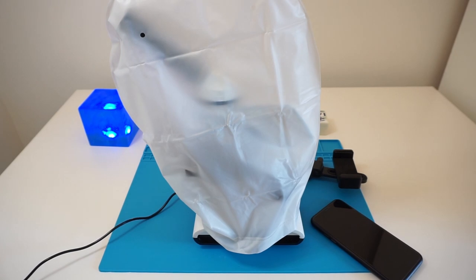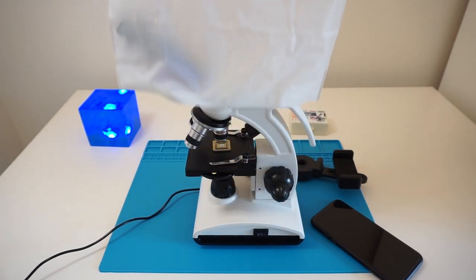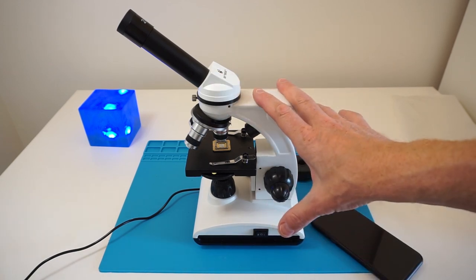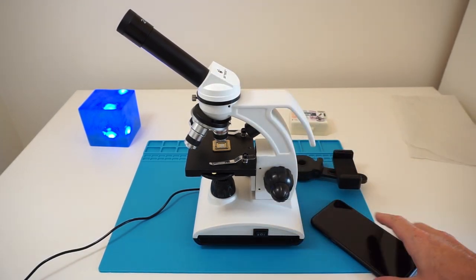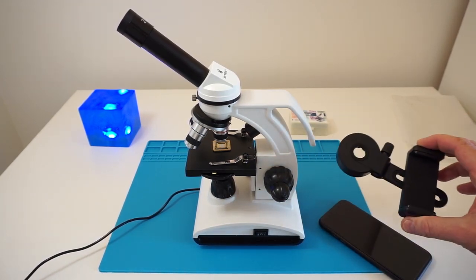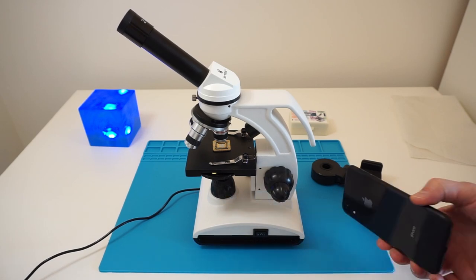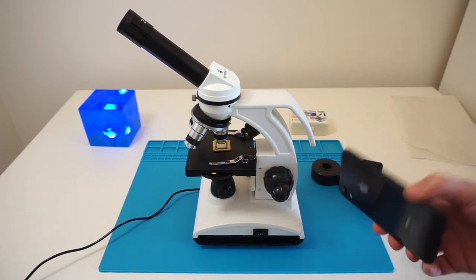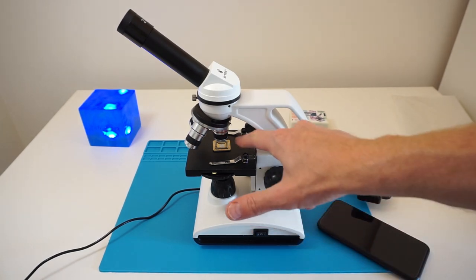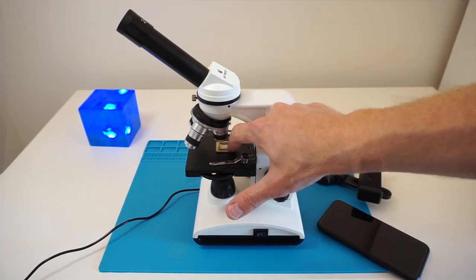Now that we have set up the microscope and played around a little bit, I would like to demonstrate you how it works. And maybe we can start by looking at the microscope. Later on we will see how we can attach this adapter to an iPhone 8, and then try to make pictures looking at a CPU die.